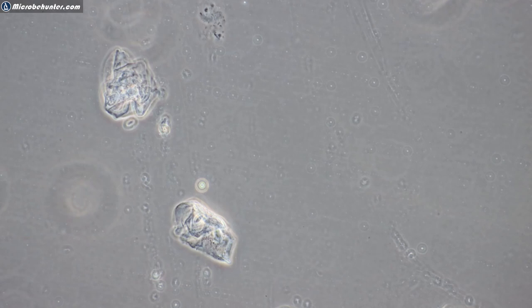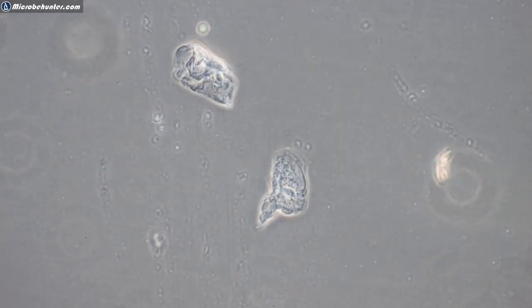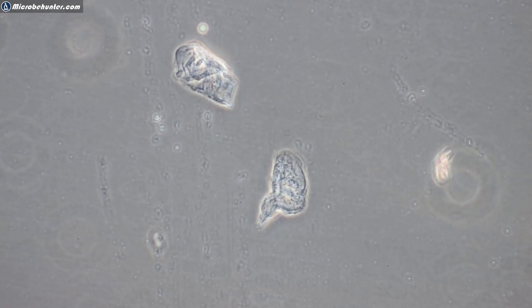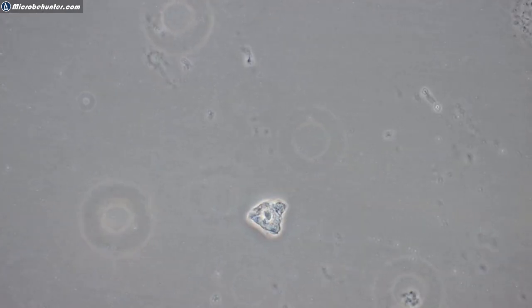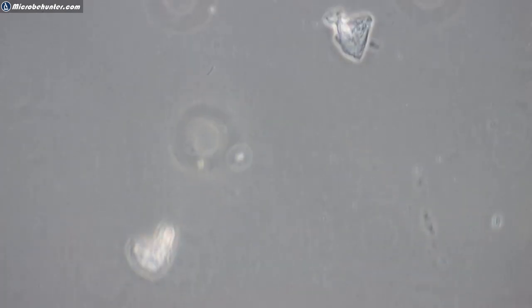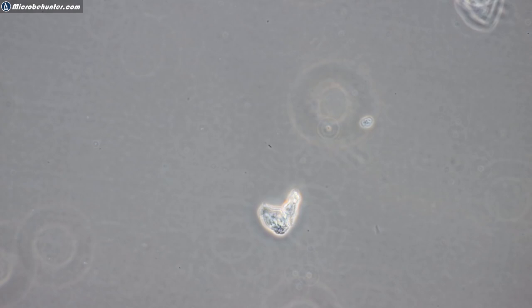Skin cells, why do we keep on saying skin cells? I don't know why, okay. So this is, in any case, epithelial cheek cells here. Here is another one, okay. The nucleus is always quite nicely visible. What about this one over here? One or two of them sticking together. They're not that many cells.